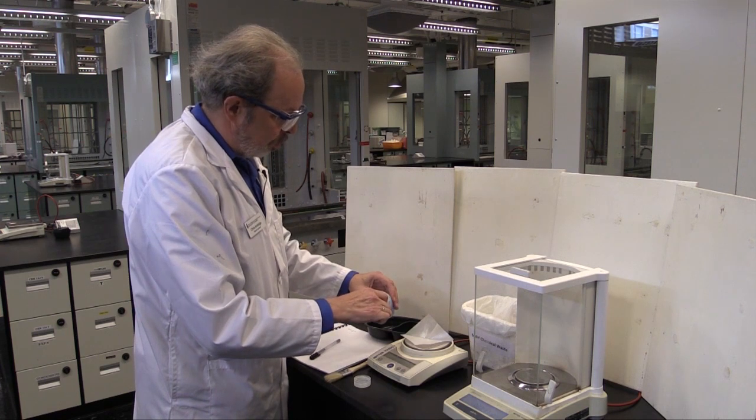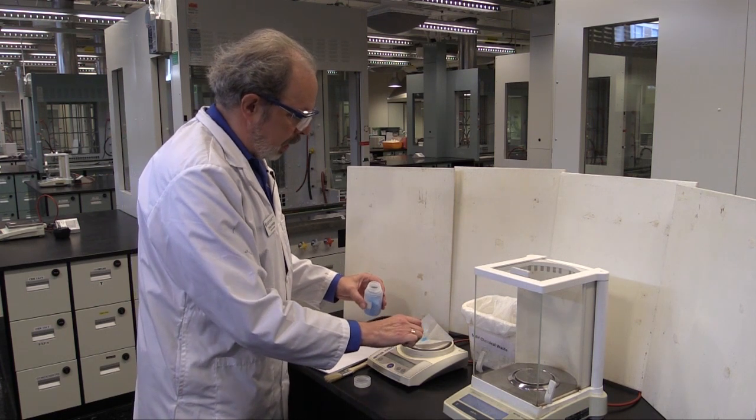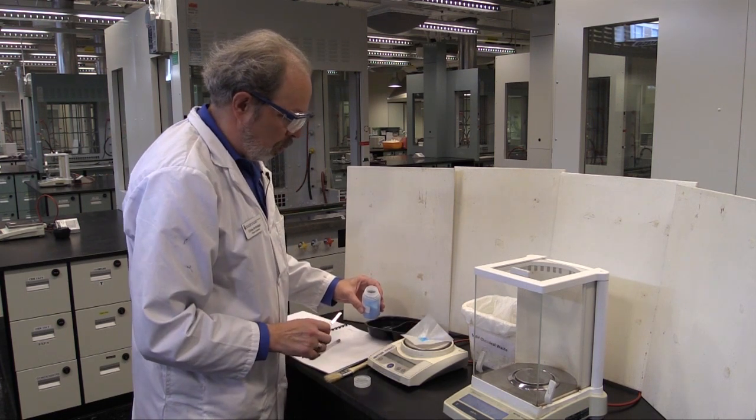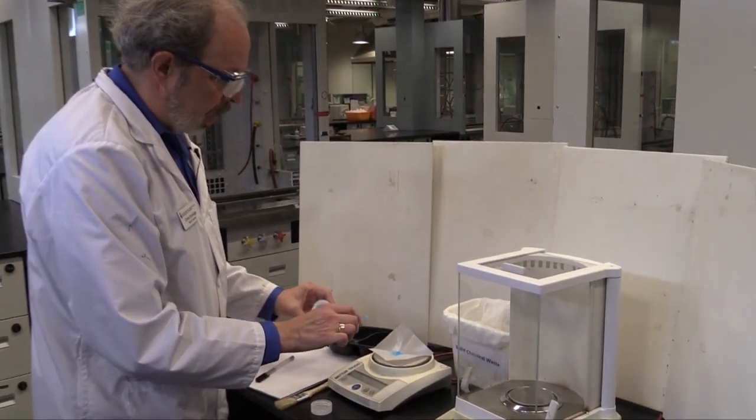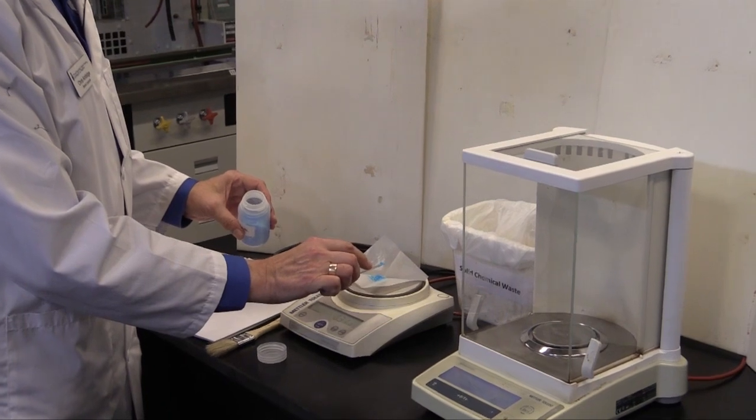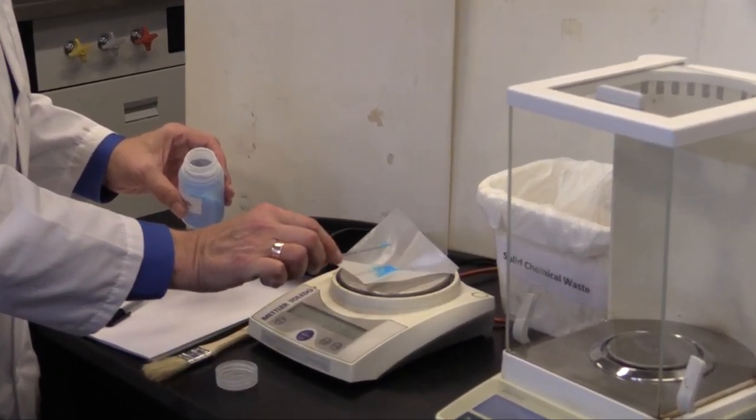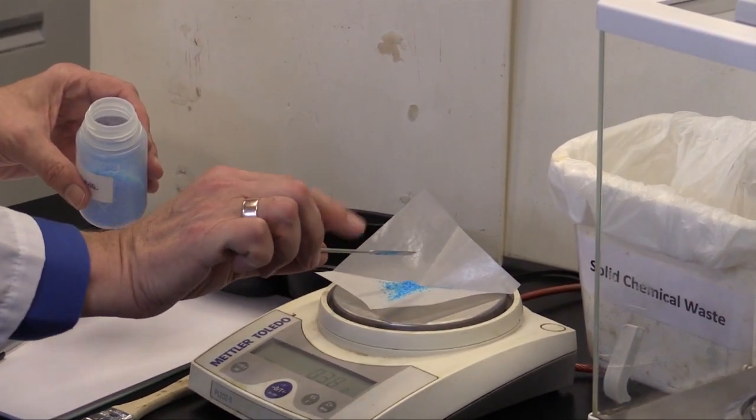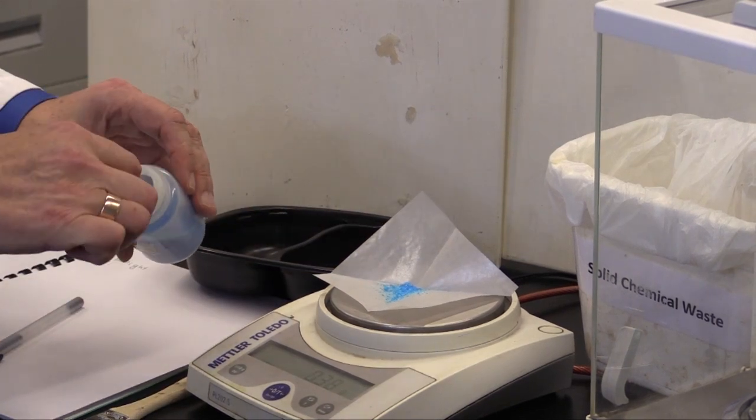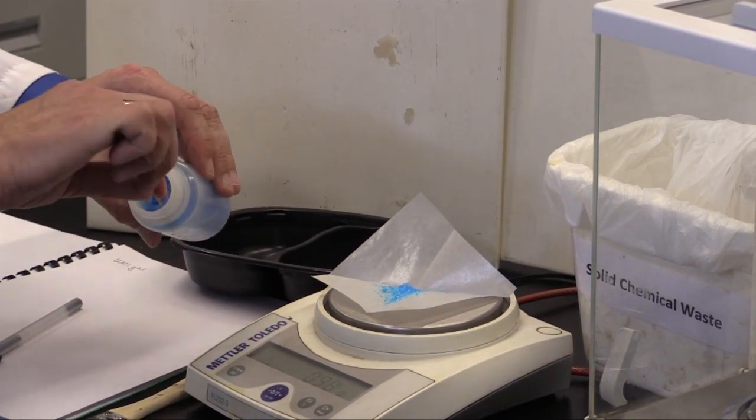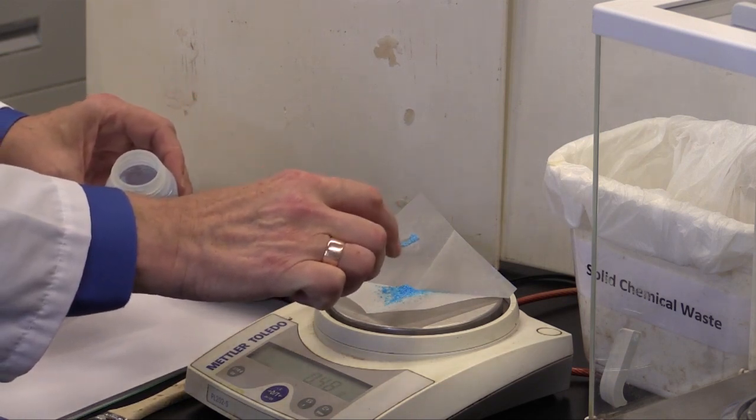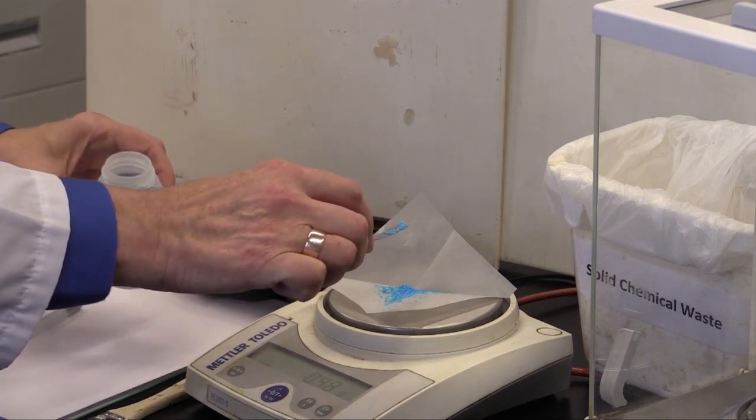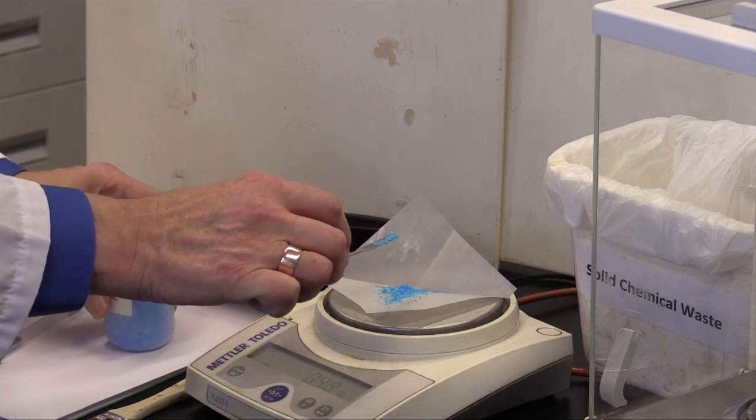Take a small amount on my spatula and place it on the weighing paper. It's 0.31 of a gram. Let's try some more. To get stuff off, if you tap the side of the spatula, you can knock stuff off. That's only 0.38, so let's add a bit more. That's at 0.49, which is as close as I'm going to get.